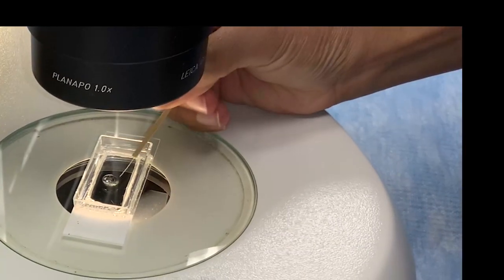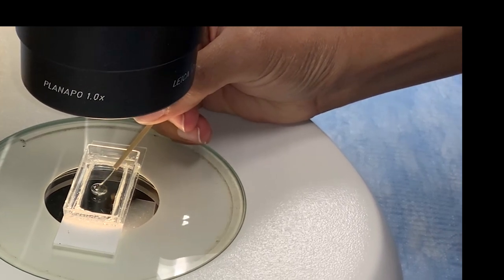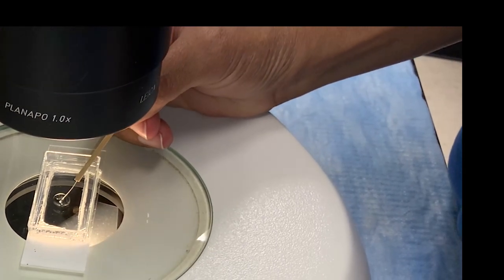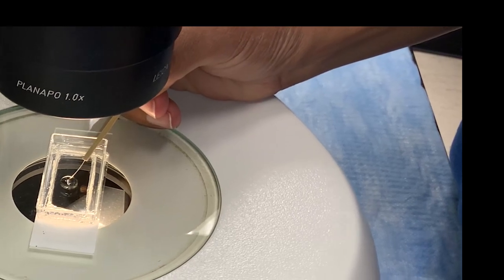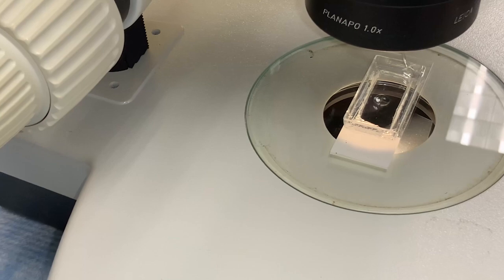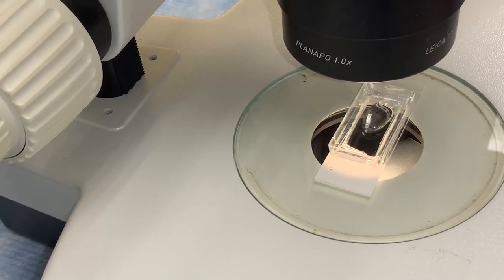Then the larva is oriented using a fine gauge fishing line before the agarose is able to harden. Once the agarose is fully solidified, the imaging chamber is then filled with medium to immerse the immobilized zebrafish larva.